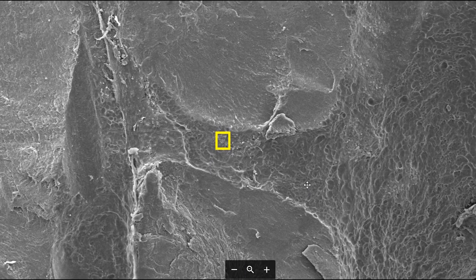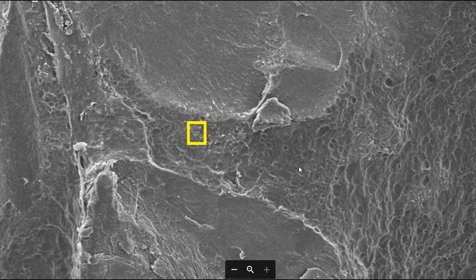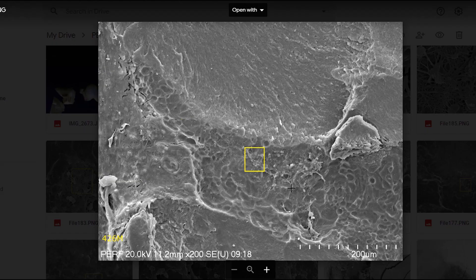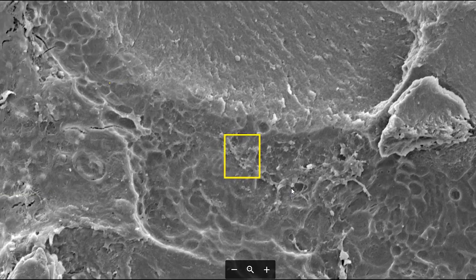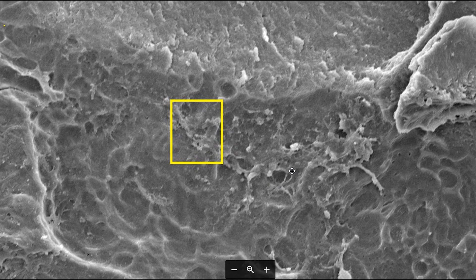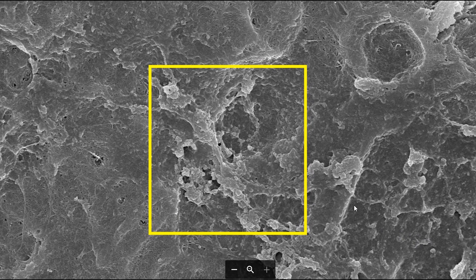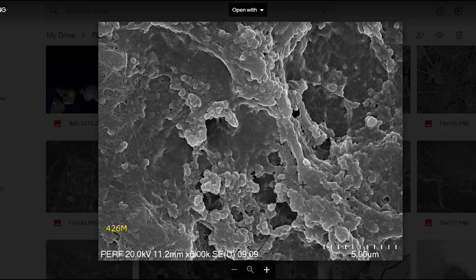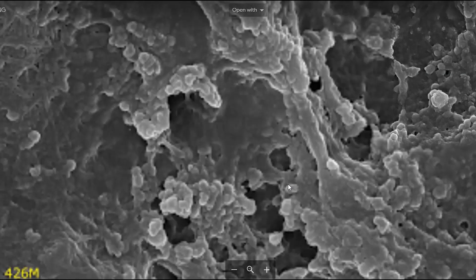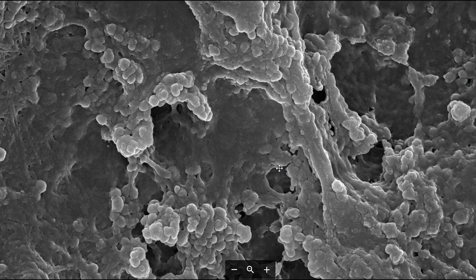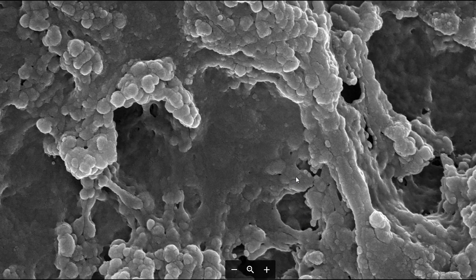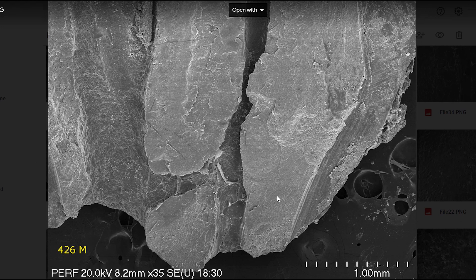Now looking at the isthmus area in between — which is where we're really interested to see how well the GentleWave actually cleans — we go into areas that are suggestive of a biofilm on the surface. But here again, at higher magnification, you can see these are just calcospherites. This is not a biofilm that has been incompletely decalcified by the EDTA.